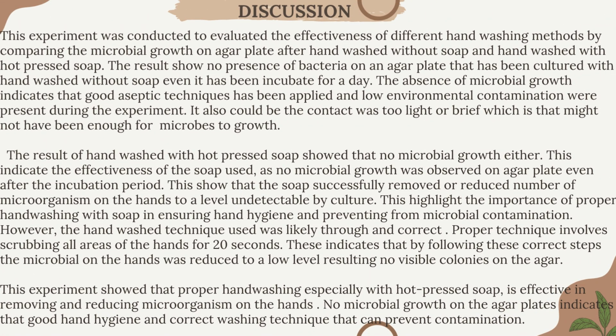This experiment was conducted to test how effective hand washing is without soap and with hot press soap. Both methods show no microbial growth on the agar plate, which means good aseptic technique was applied and low environmental contamination was present during the experiment.